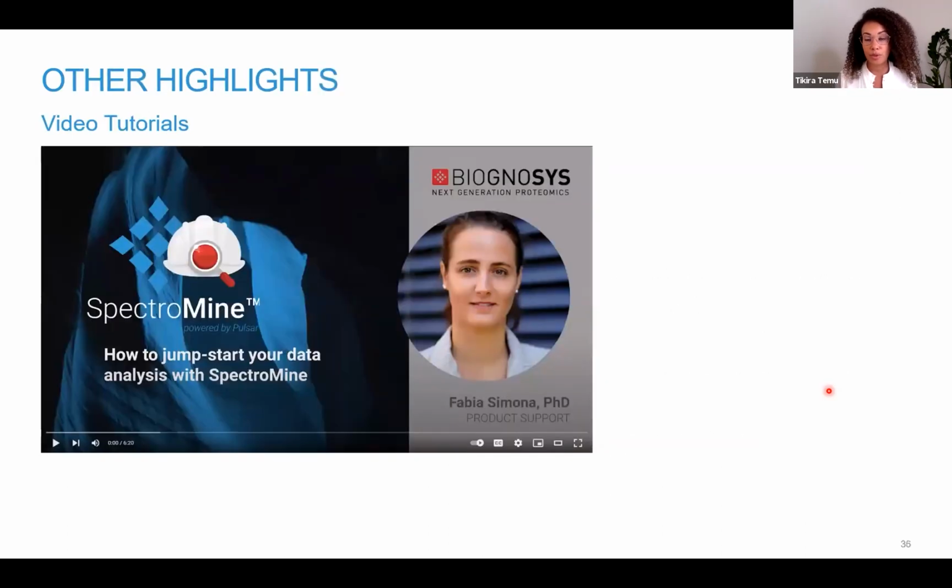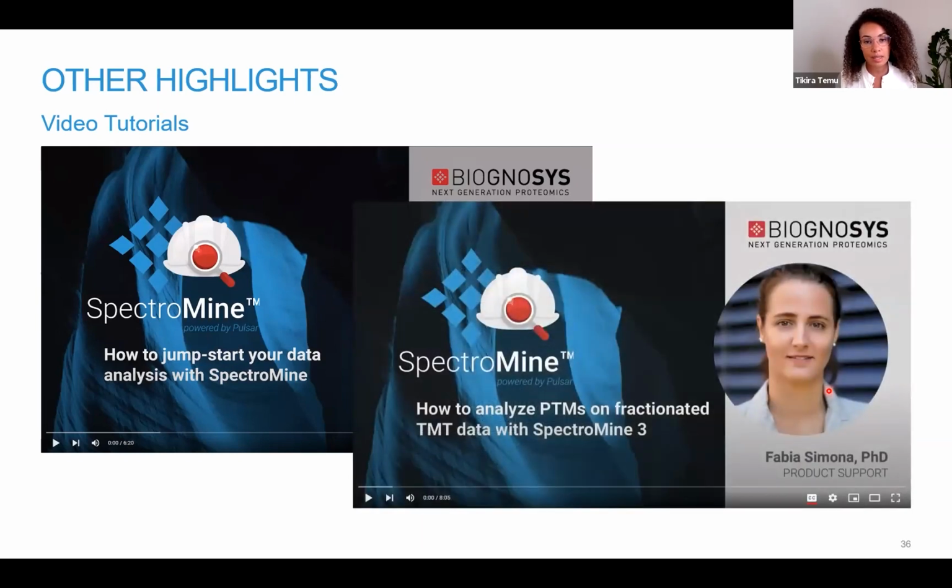But for those of you who want to know more, and since 20 minutes are just really not enough, we have 2 videos by my colleague Fabia Simona. So one is how to jumpstart your data analysis. So this is more for the beginners, but then also what is super interesting is looking at what is new in SpectroMine 3, where you can have a look at an example of a fractionated PTM-TMT dataset.